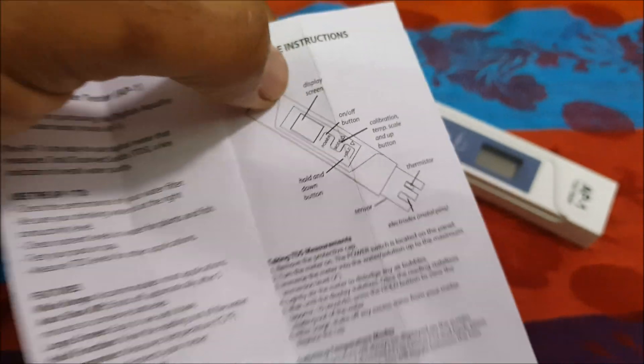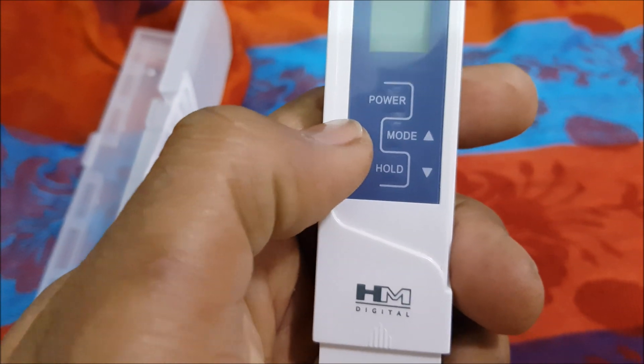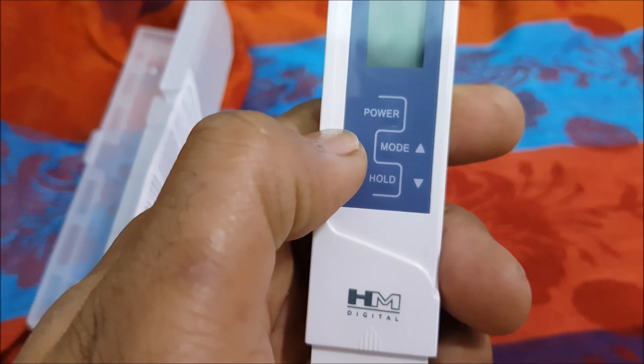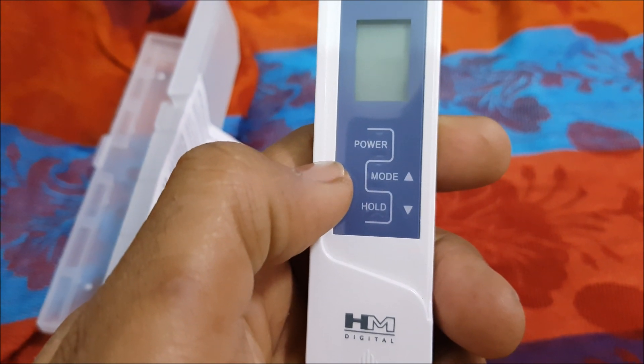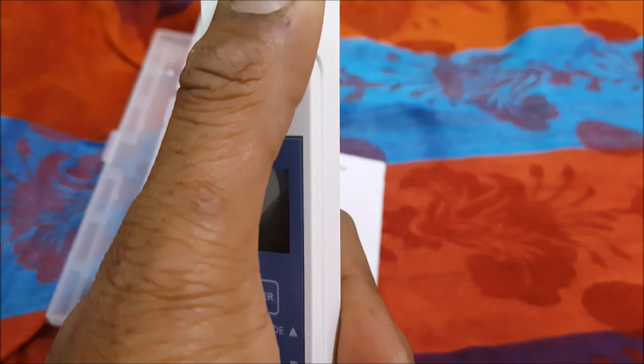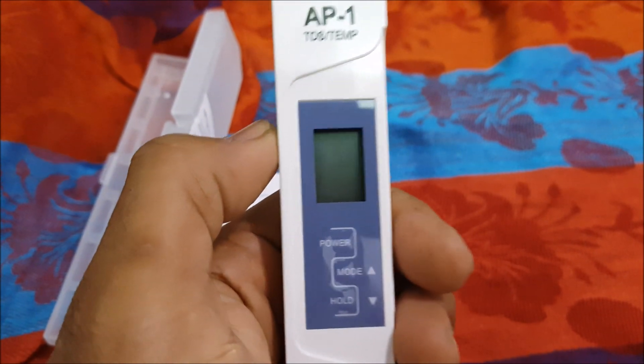After the power button there is a mode button. We need to ensure that we never accidentally press this mode button, as it is used to configure the TDS meter.